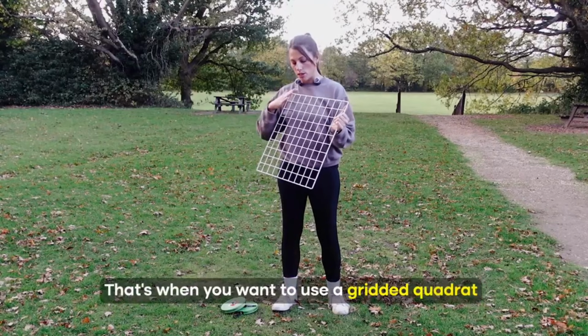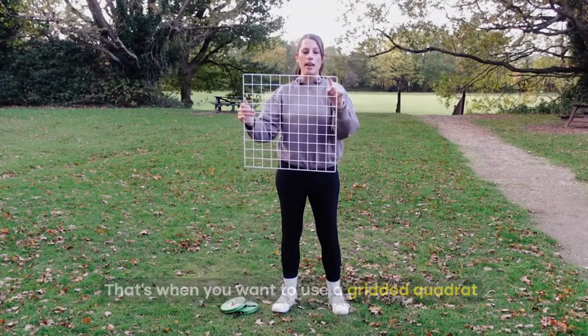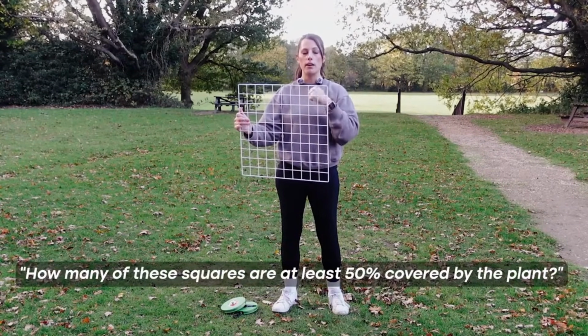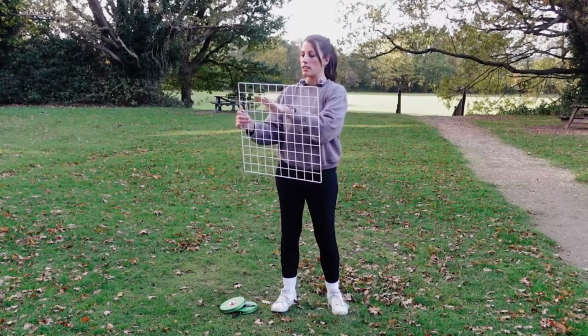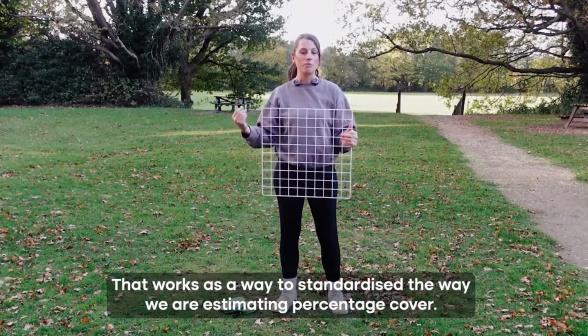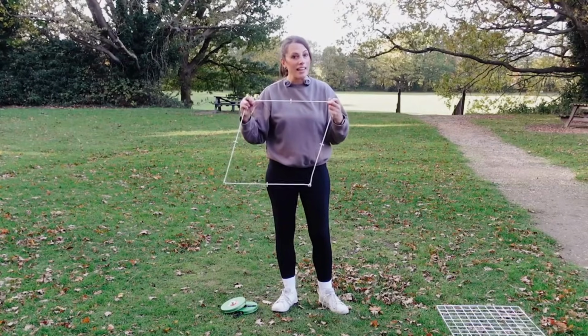And that's when you want to use a gridded quadrat. So you could place the quadrat down and students can estimate how many of these squares are at least 50% covered by the plant. And if it's at least 50% covered, we'll count that as 1%. And the reason we're saying at least 50% covered is that works as a way to standardize the way we are estimating percentage cover.